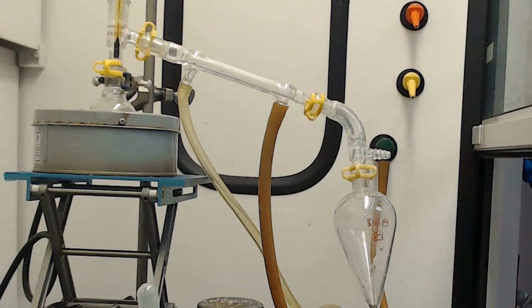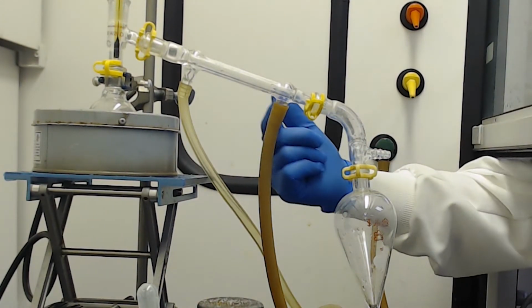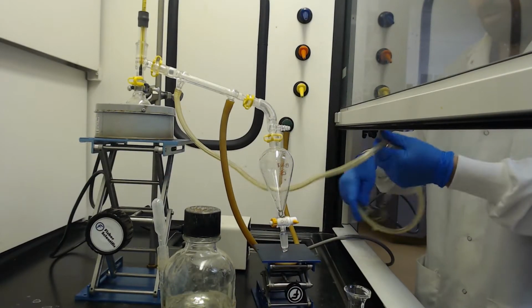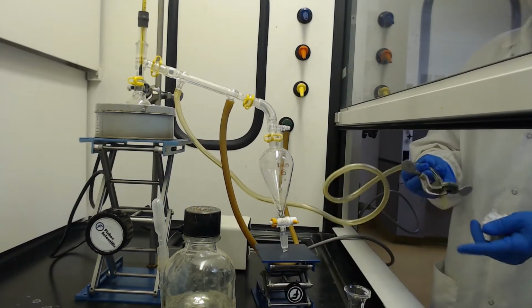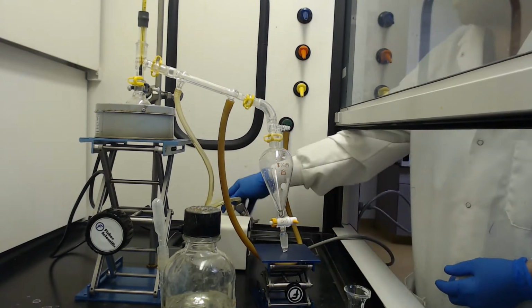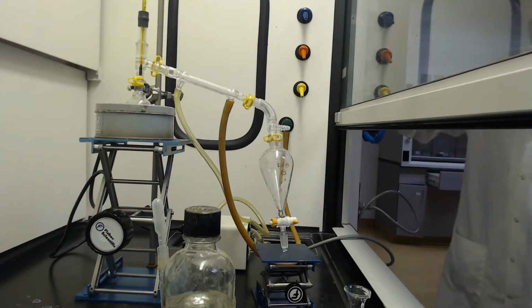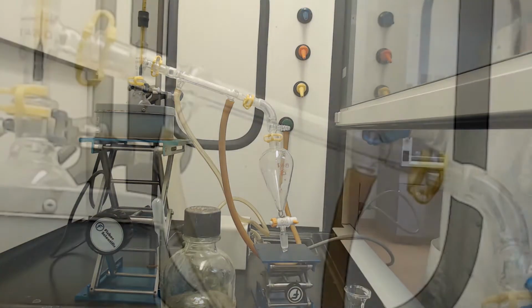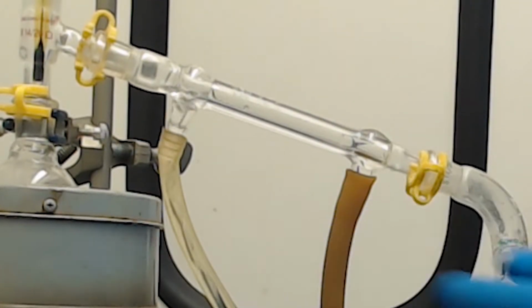And I'm going to start the water flow. So I've got the water going in the lower one, coming out the top one. And again, this hose kind of wants to do its own thing, so I've got this extra weight on it, just clamped on there so we can hold it there. And again, you just want a slight flow. You don't want to overdo it, because if you turn it on too much, you can put too much pressure on these, and they'll come apart.